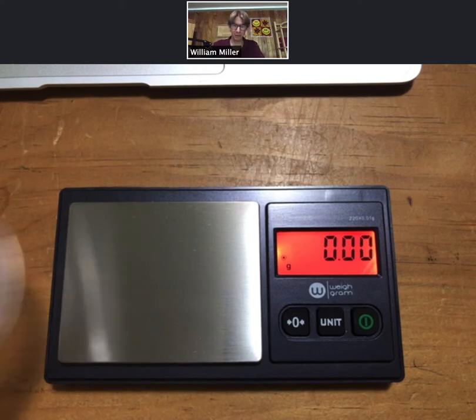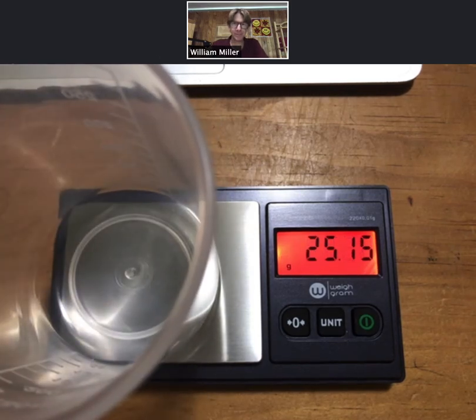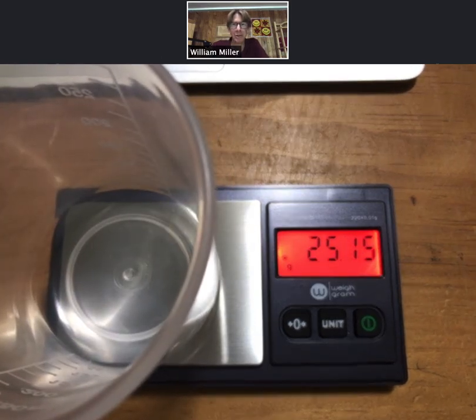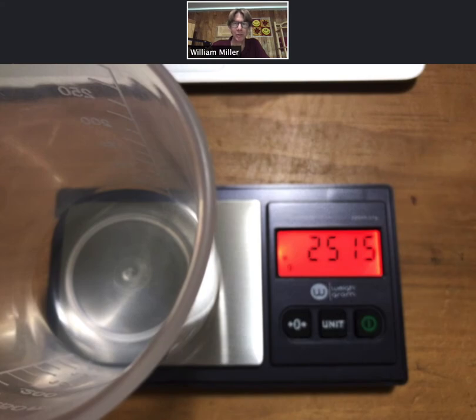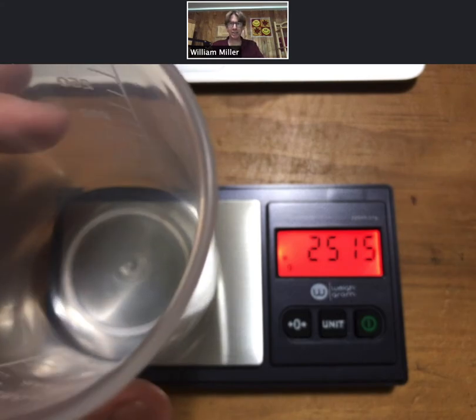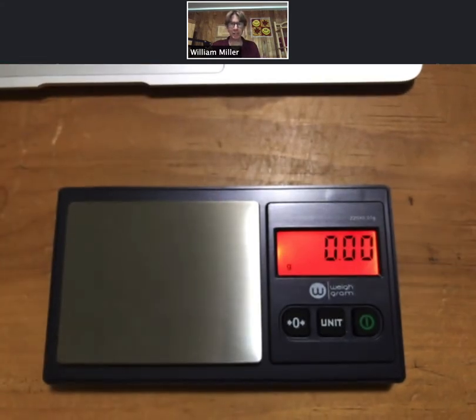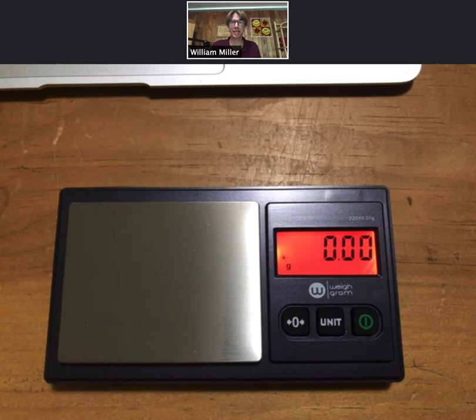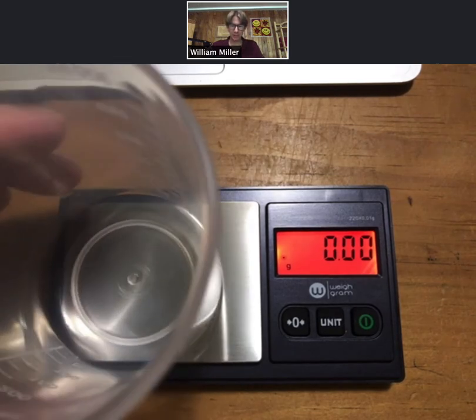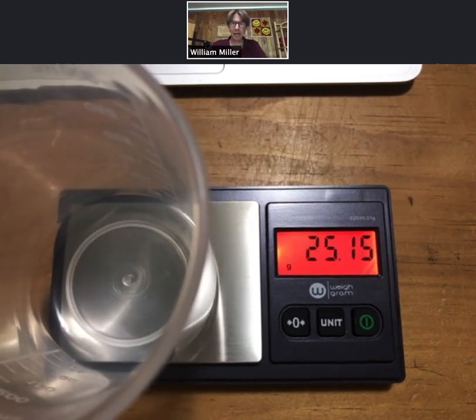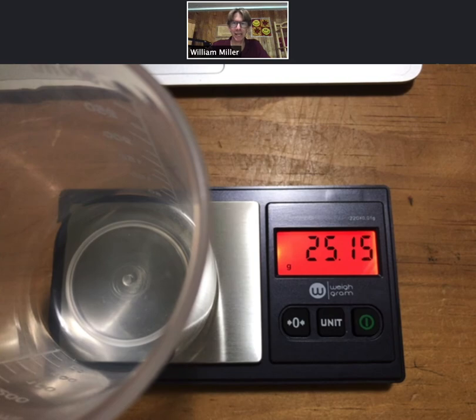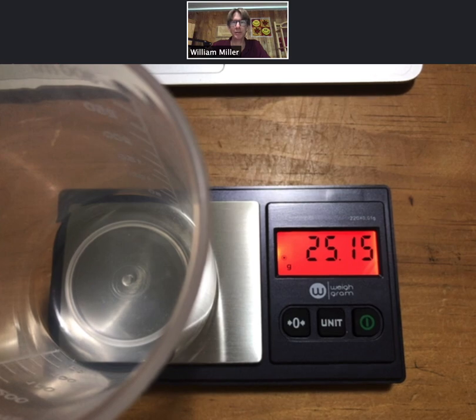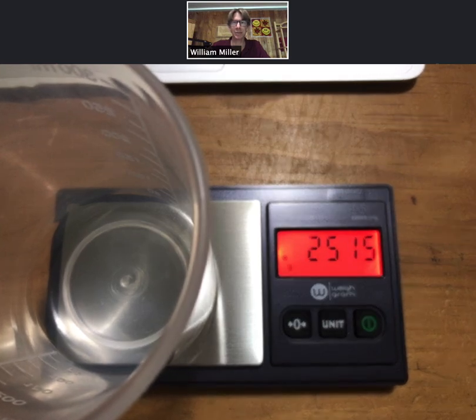You can see that the scale read 25.16 grams before, and then it read 25.15. That's a good example of the error in the scale being in the hundredths place, and we'll talk more about error throughout the course of this and the rest of the experiments.